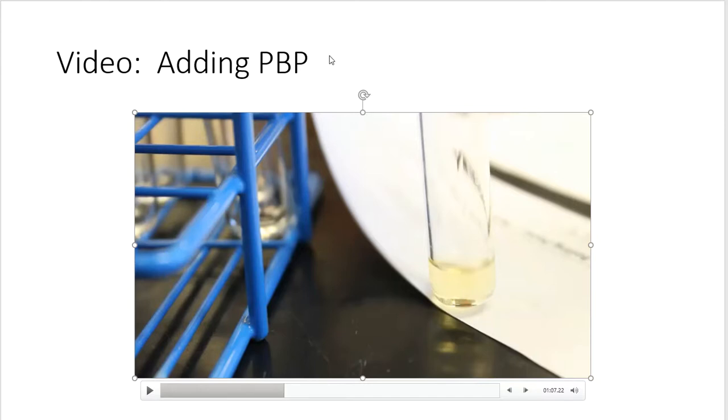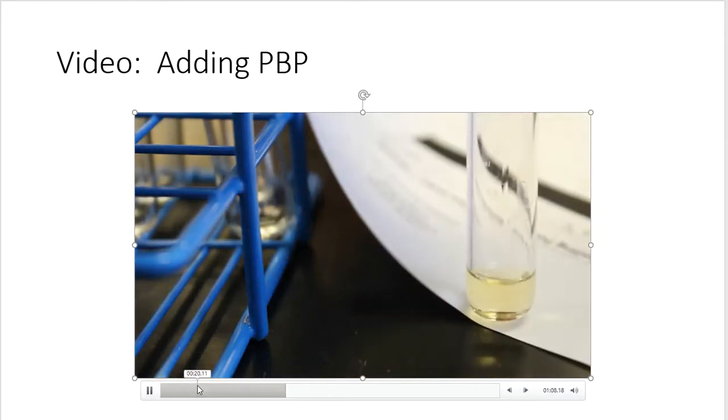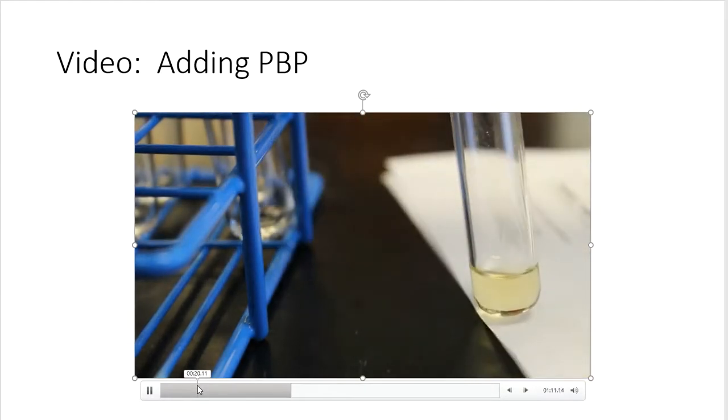The first 2 drops went colorless. No more orangey, brownish color that was there. Now, with the addition of the extra 10 drops, you might see a little bit of faint yellow that is still there, but that's just because of concentrations and amounts. So if we added a little bit more octene to that test tube, there's a chance that that extra yellow color would have also disappeared. But it is not orangey or deep, deep yellow color like a negative test would give us. All right, so just keep that in mind as you watch these remaining test tubes getting tested. There's the solution of octene.